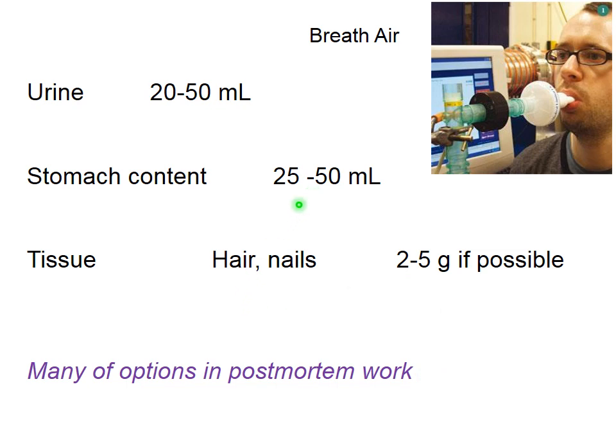Oh well, you can swab skin. You can take saliva. Taking saliva, the easiest way is putting in cotton and then asking a person to chew it. It will collect around 1 ml of saliva. There are different approaches to do that. There are actually special ampoules for collecting saliva.